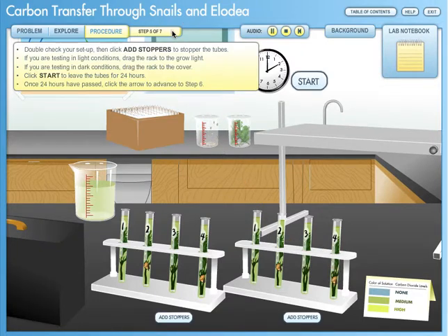Double-check your setup, then click Add Stoppers to stopper the tubes. If you are testing in light conditions, drag the rack to the grow light. If you are testing in dark conditions, drag the rack to the cover. Click Start to leave the tubes for 24 hours. Once 24 hours have passed, click the arrow to advance to step 6.